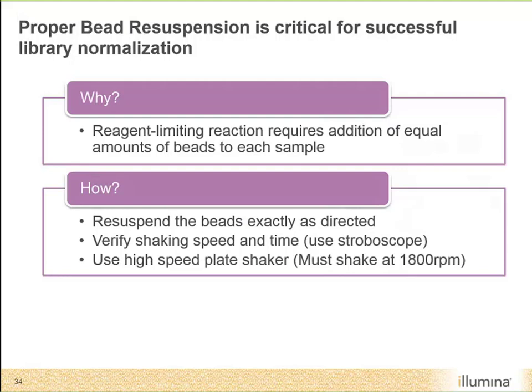How do we do this? We make sure that the beads are resuspended exactly as directed. We want to verify the shaking speed and time, and we highly recommend that a high-speed plate shaker that can reach 1800 RPM is key.